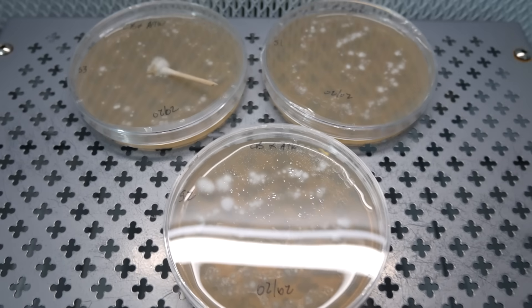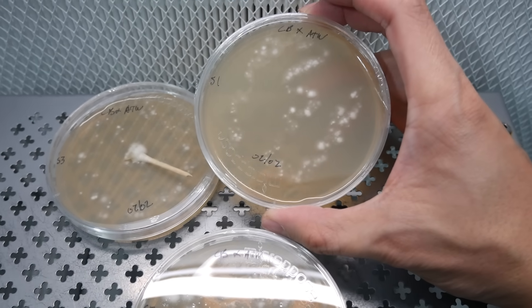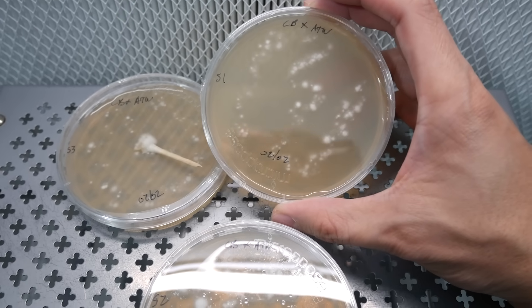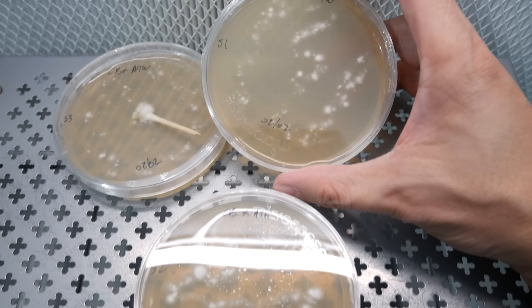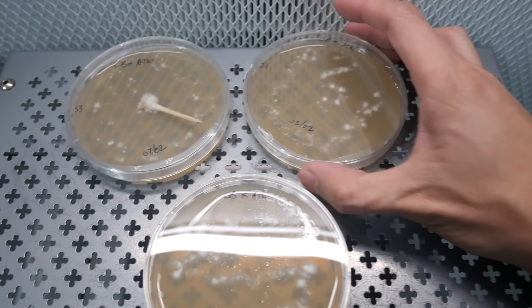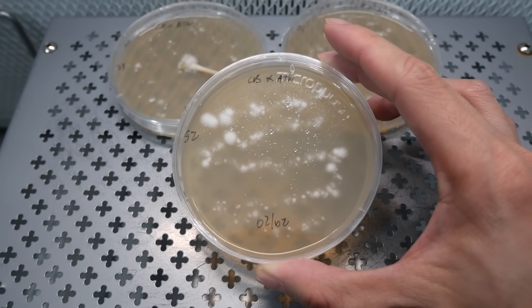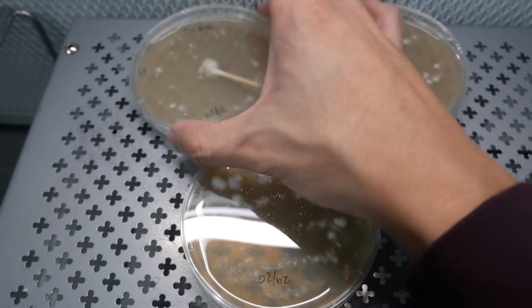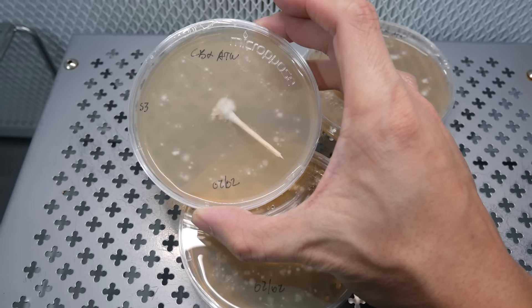Six days after the plates have been made, a lot of spore colonies have started to appear along the streaks. There's a good chance these spores have definitely mixed and mingled — look at that, thousands of microscopic spores all up on that plate.